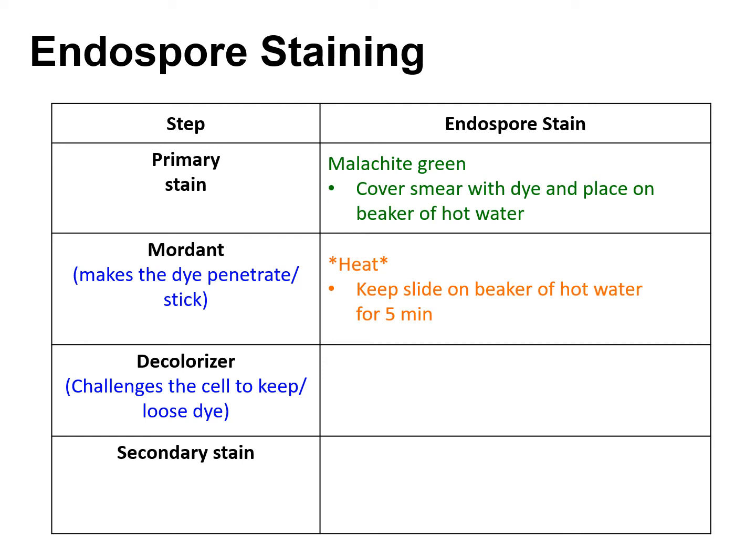The mordant is heat. We take the slide with malachite green and place it on a hot water beaker. The hot steam acts as the mordant, helping the malachite green penetrate deep into the cells and into the endospore. After leaving it on the hot water beaker for about five minutes, we decolorize by rinsing the slide with water. The water washes off the malachite green from the bacteria cell, but not from the endospore.